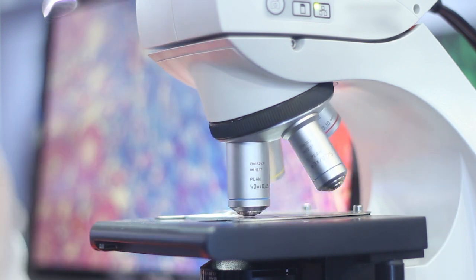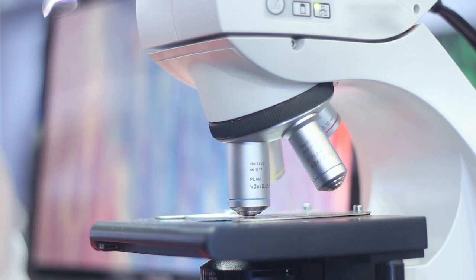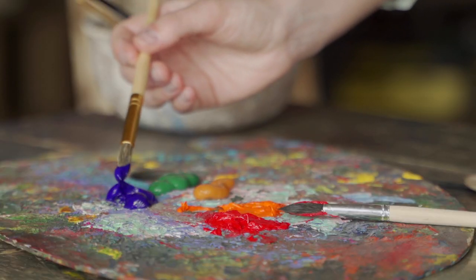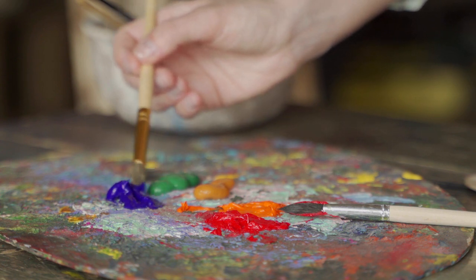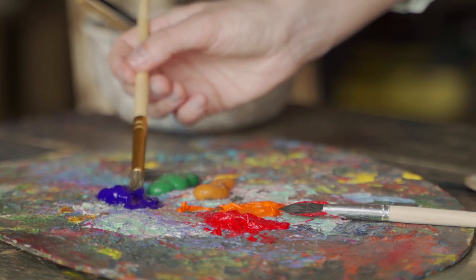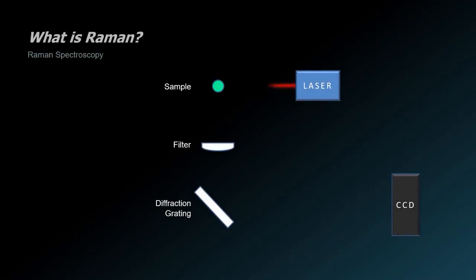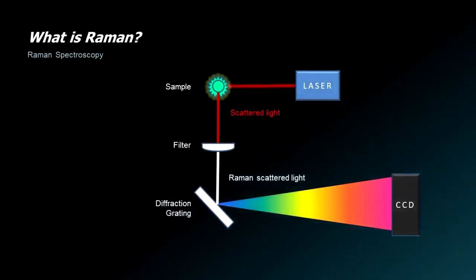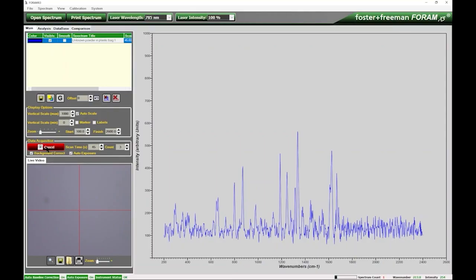So Raman spectroscopy is a known and recognized technique in art and conservation areas, where it is used to identify different pigments and inks that have been used to construct these paintings and artifacts. Raman spectroscopy typically produces a range of narrow band peaks. Those peaks are a direct measurement of the energy required for a molecule to undergo particular motions, that is vibrational spectroscopy.